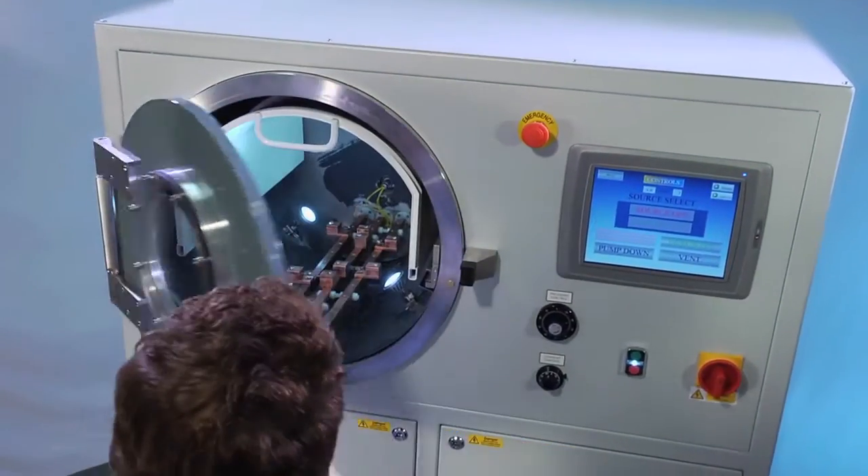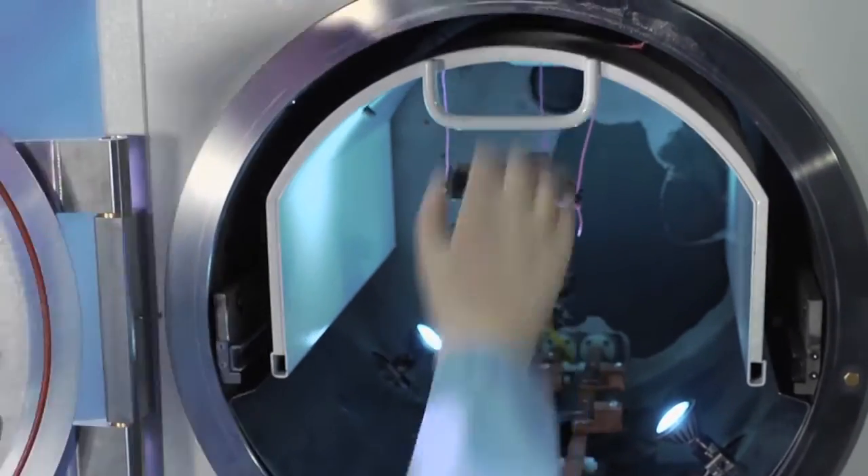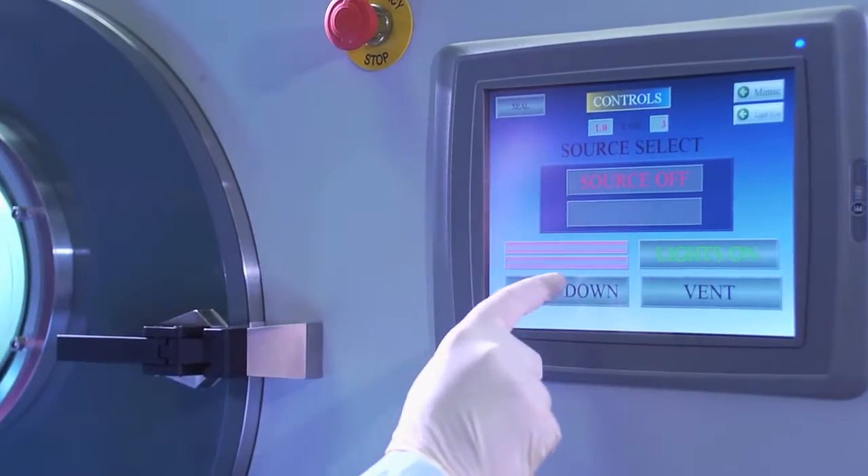Here's how it works. The article to be processed is put into the vacuum chamber using the retractable work holder, and is held securely in place by magnets or suspended by thin wire, while the vacuum sequence is started.